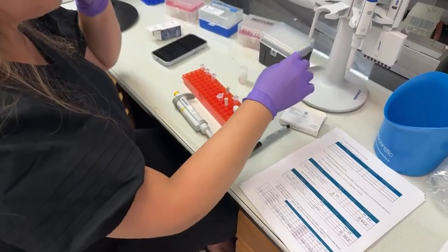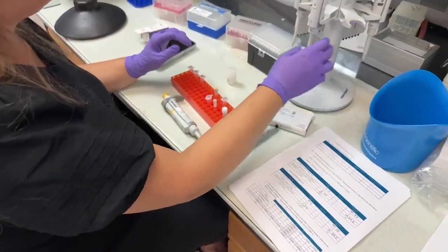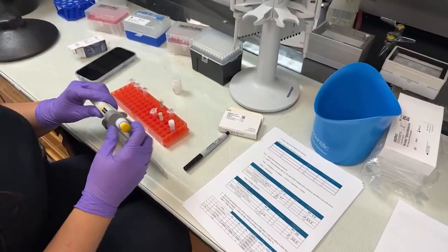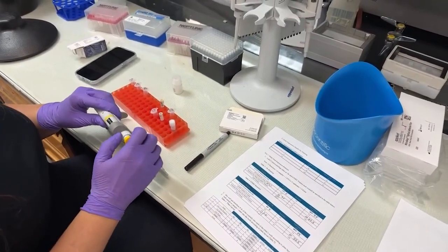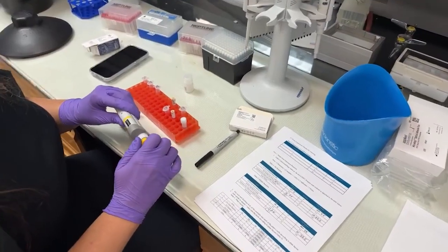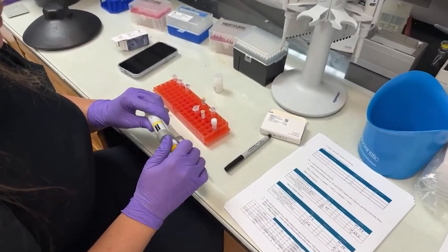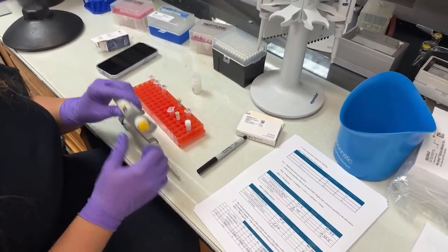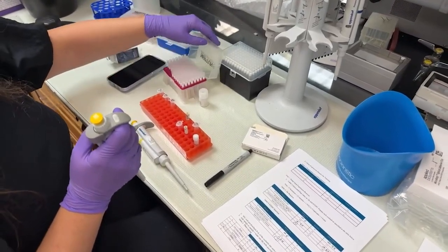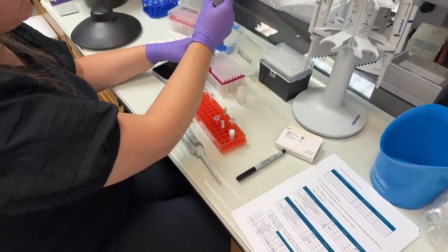And then we need water. We need 37.5 microliters of nuclease-free water. It is important when you're setting up these reactions, because we're working with DNA, sometimes RNA, that we are providing our enzyme with the right water.